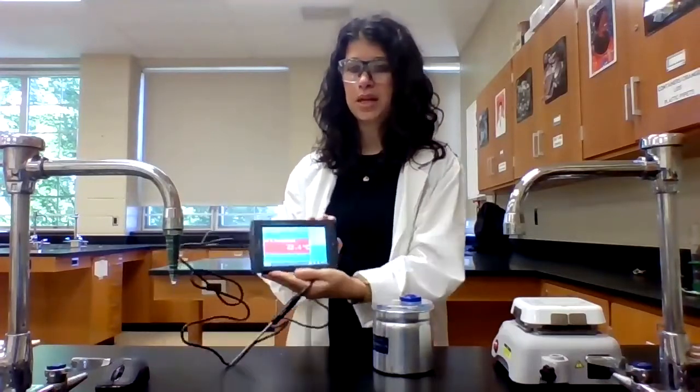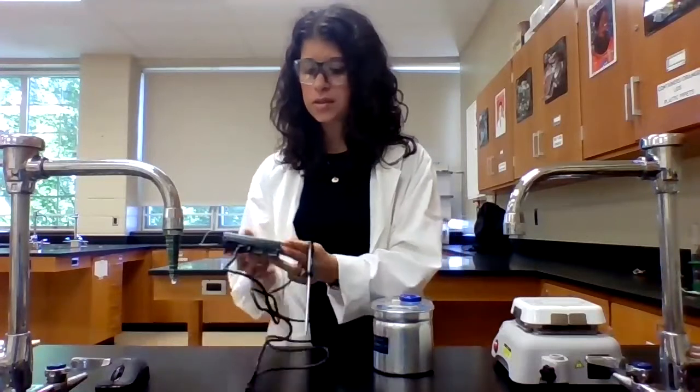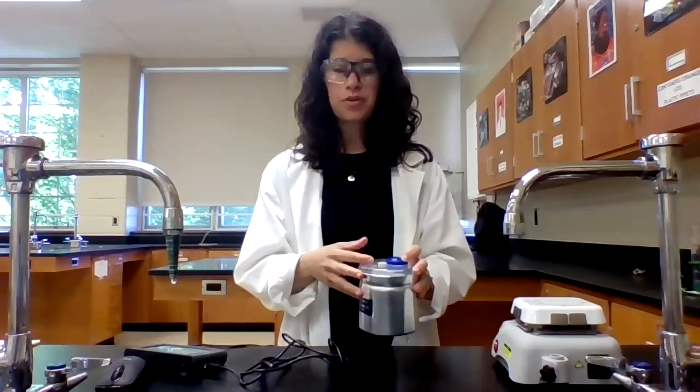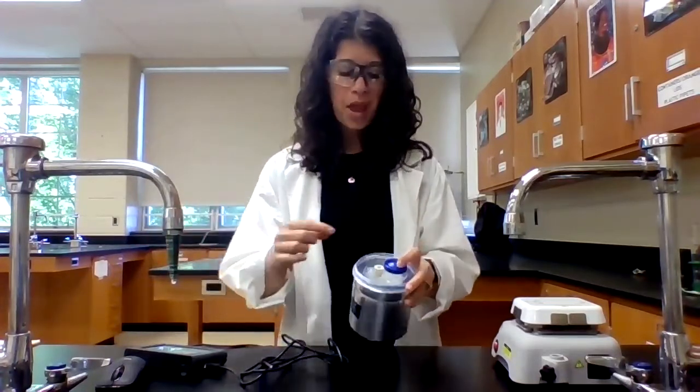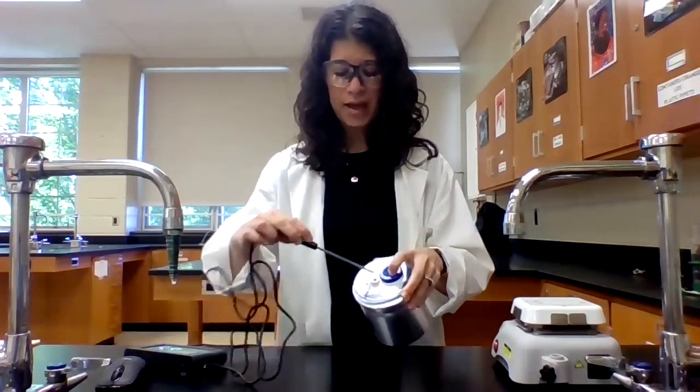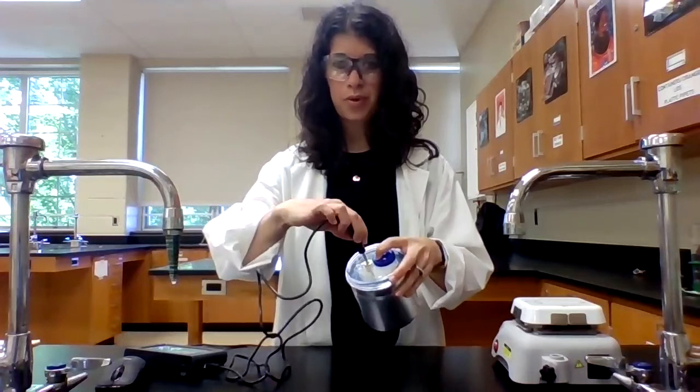So the equipment that we need for this lab, we need something to monitor the temperature. So we're going to be using our temperature probe, which is connected to our LabQuest. And then we're also going to be using a calorimeter. A calorimeter is a great device to do a reaction in when we want to isolate it in terms of heat. We don't want any outside heat coming in, and we don't want heat escaping out. There is a hole at the top of the lid here, so that my temperature probe can get inside.